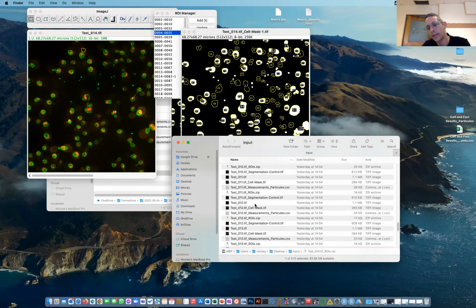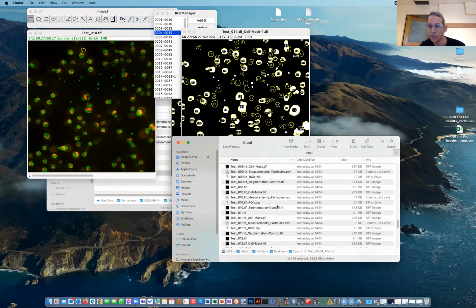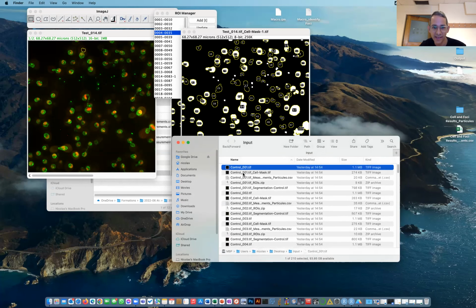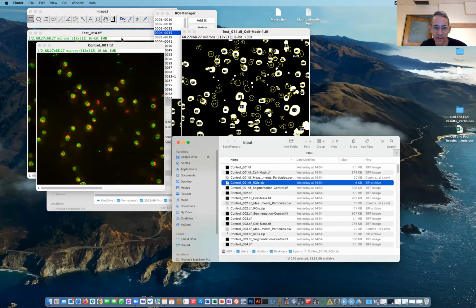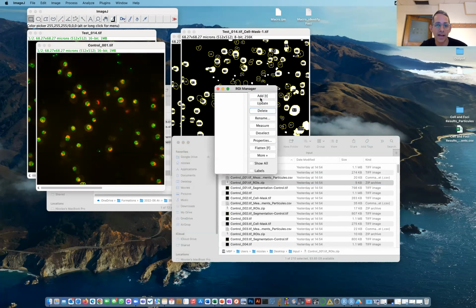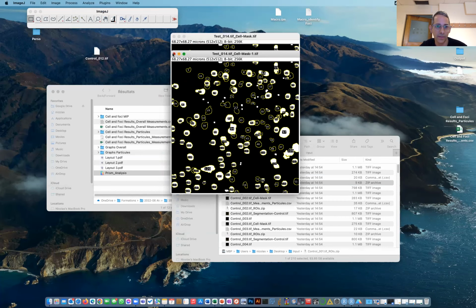I will get back to that, fix whatever was wrong, and report back. So it's a very good way to analyze, and maybe I should be more careful when I do my analysis, to understand why it works for one image but doesn't work for the other one. Let's try that. Oh no, I know what I did. Yeah, that works perfectly. Oops.